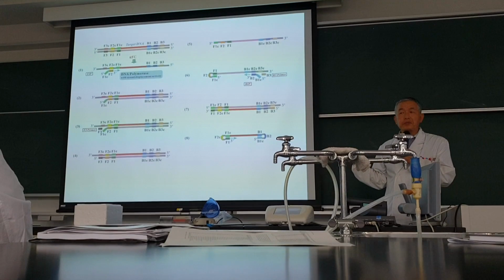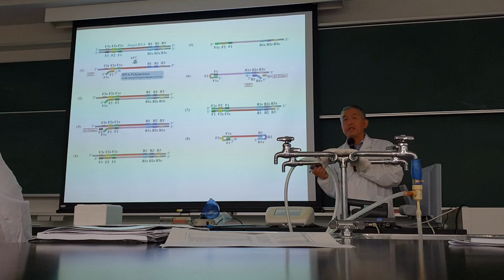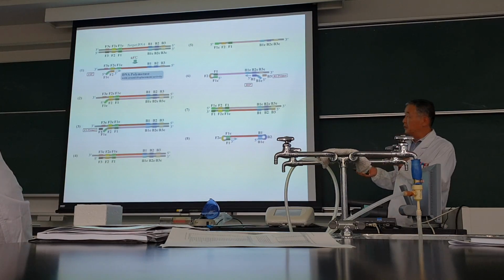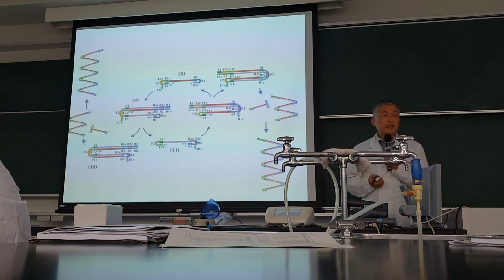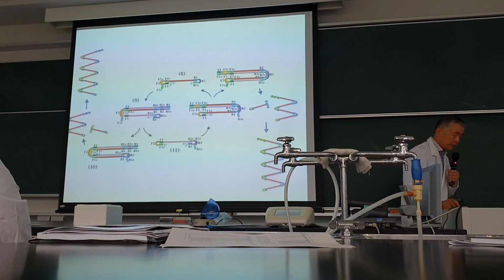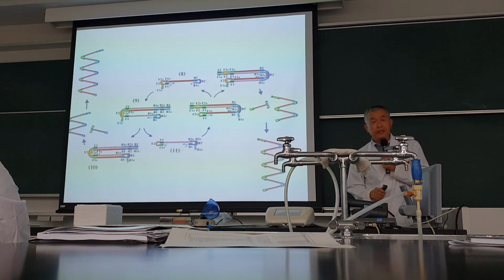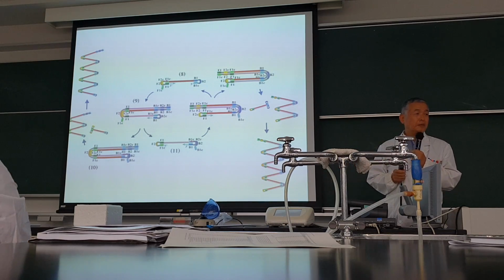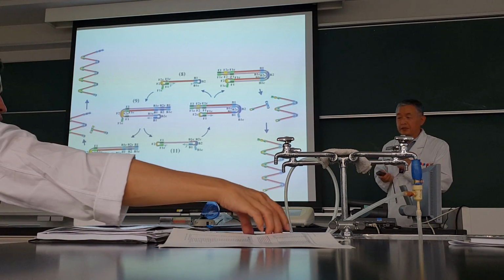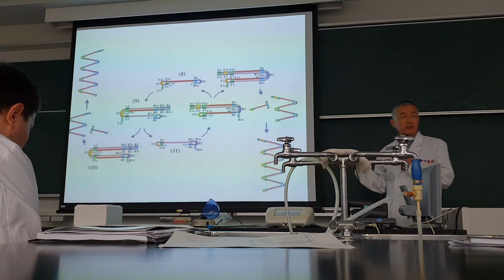This is the schema to explain how those genes can be amplified. It takes 2 pages. You can also see the application system on the internet. So if you are interested, you can follow the LAMP homepage, because it is not clear to explain, sometimes confusing.